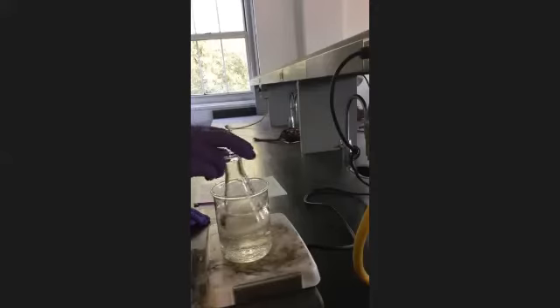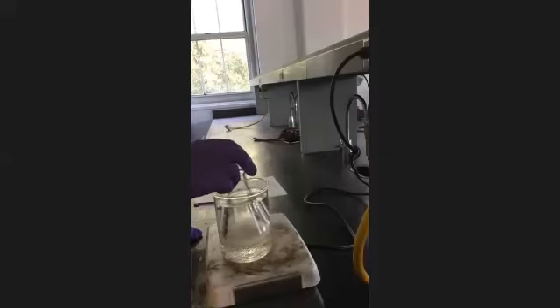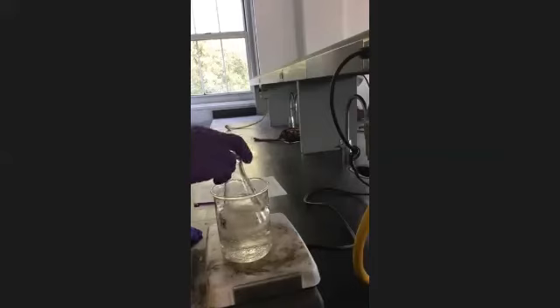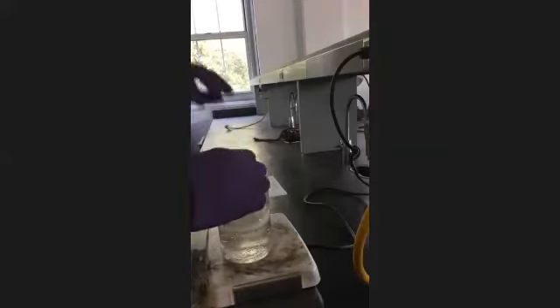That's good. You don't have to swirl it, just let it sit and twist it. Twist it like you turn a knob. Let me show you. Just twist it, like you turn the knob, like that. Keep that water hot, because if the water's not hot enough, it's going to solidify, which is what it just did up here. This thing has been cooking too.